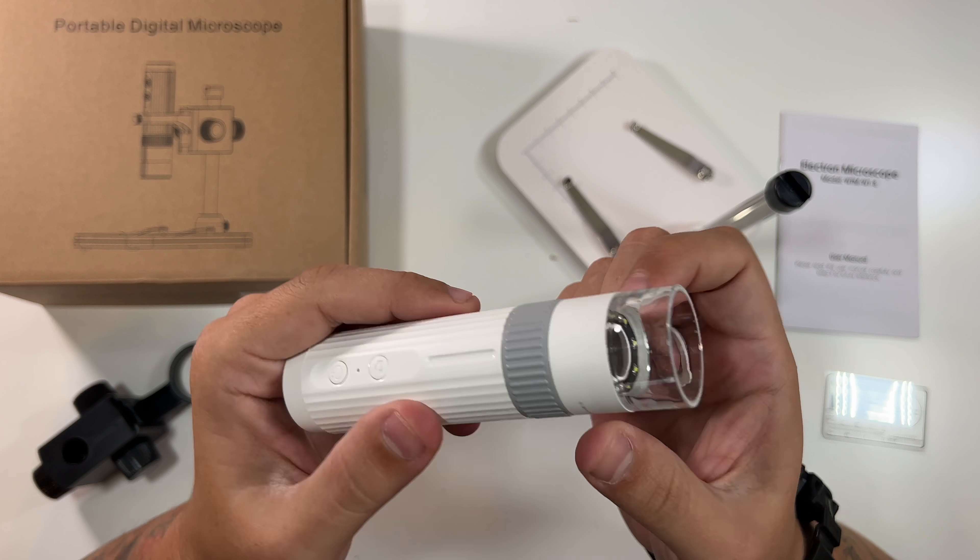I went to Central Park in New York and got this coin. Let's put the coin in place — yeah, look at that! It has zoomed in to the coin. Through the program here we can click to take a photo, and we've taken a photo of our coin. That was actually really smooth and easy.